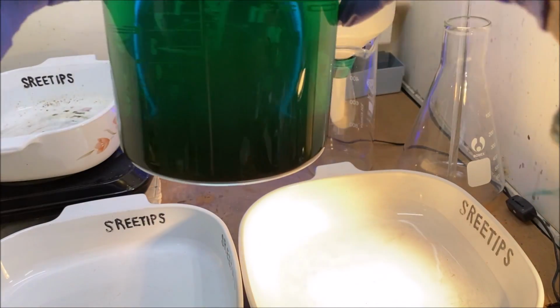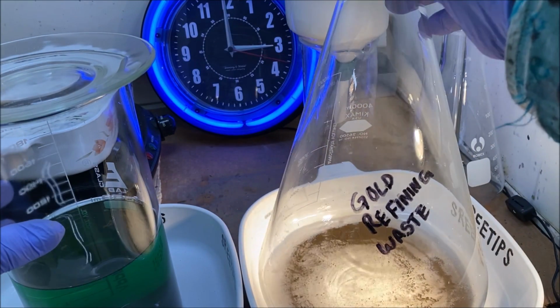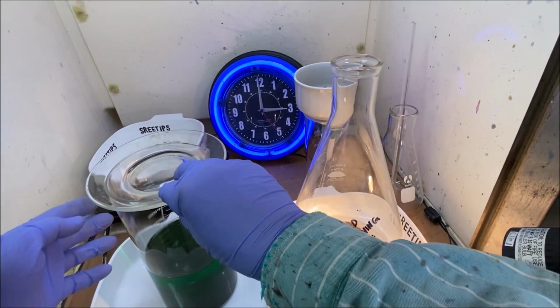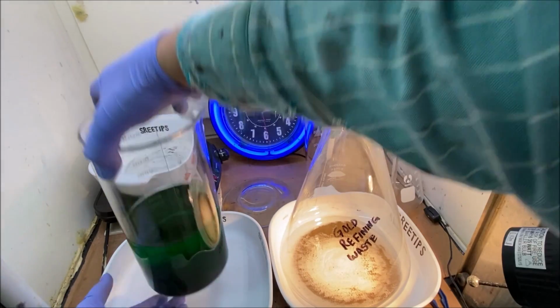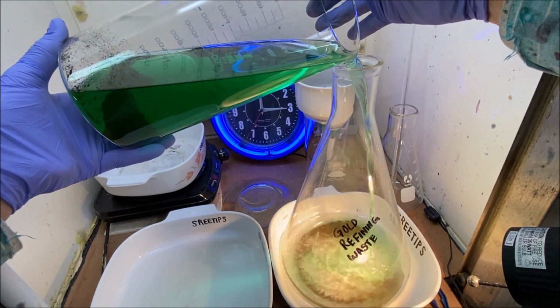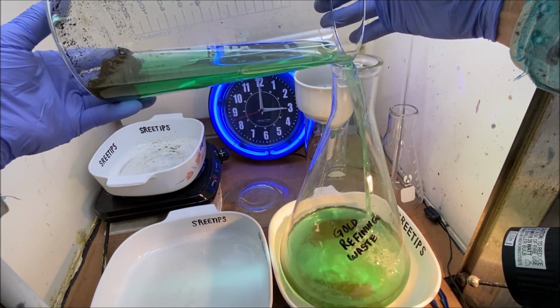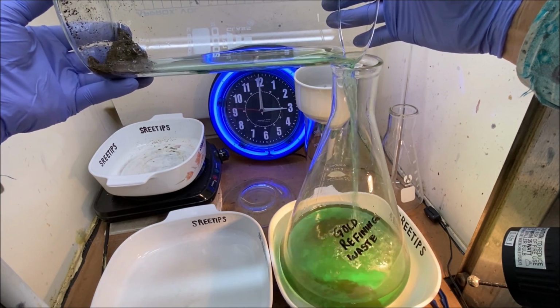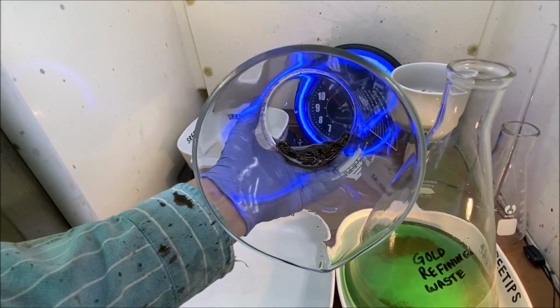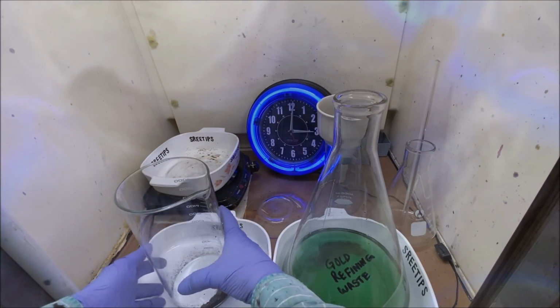Allow this to settle for a while. You can see our gold settled out down on the bottom of that beaker. Now what we'll do is pour this off into our gold waste container. Here's what our gold looks like down in the bottom of our beaker. Let's rinse this off.